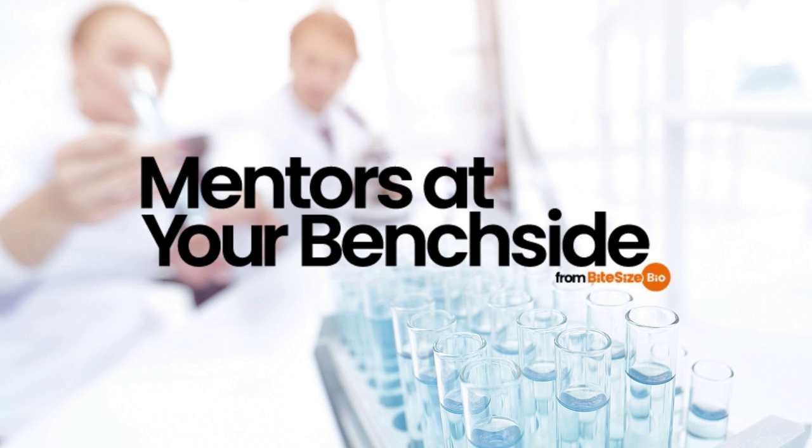The first is bias. Earlier on, I asked you to hold a thought regarding classifying particles. I also mentioned that cryo-EM structures suffer from bias. These are cardinal points because they represent a significant problem with cryo-EM that needs to be addressed going forwards.